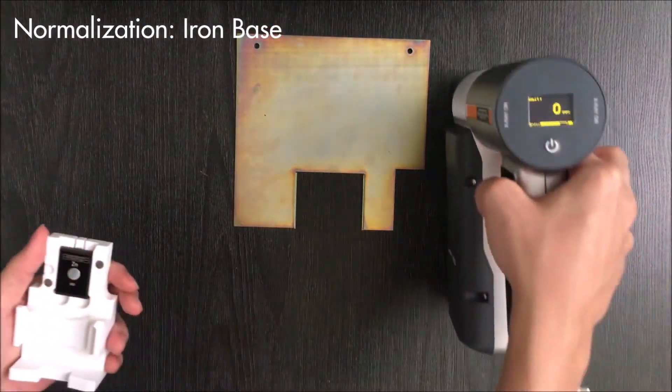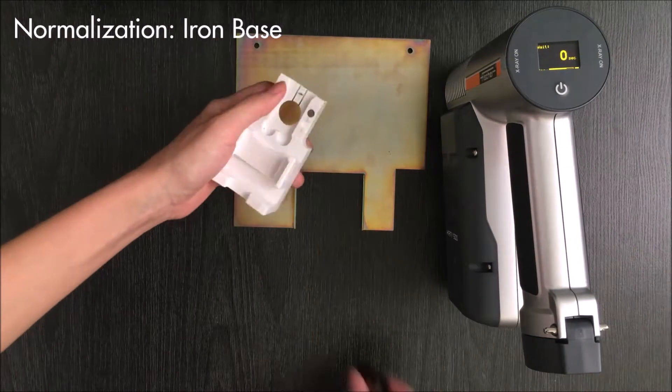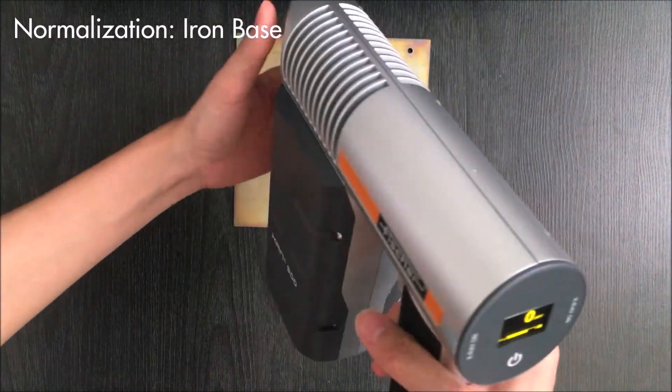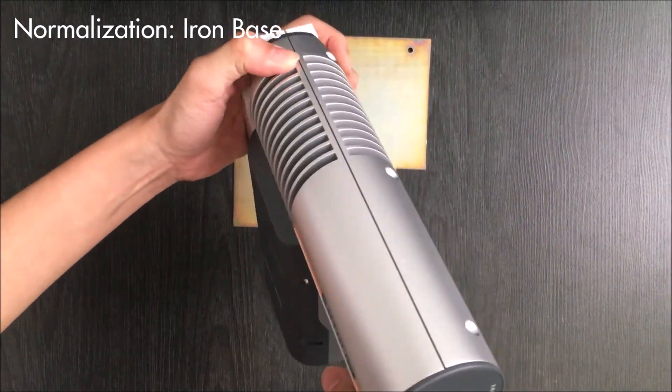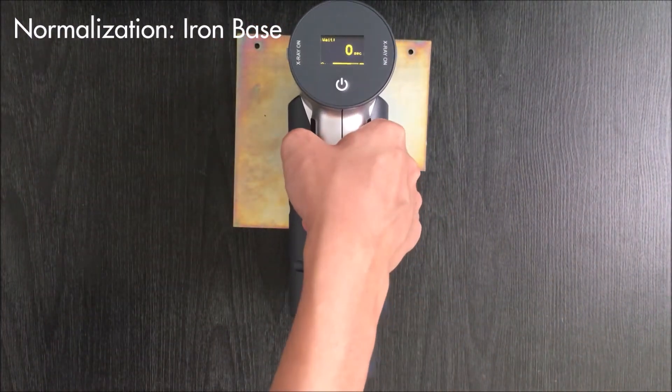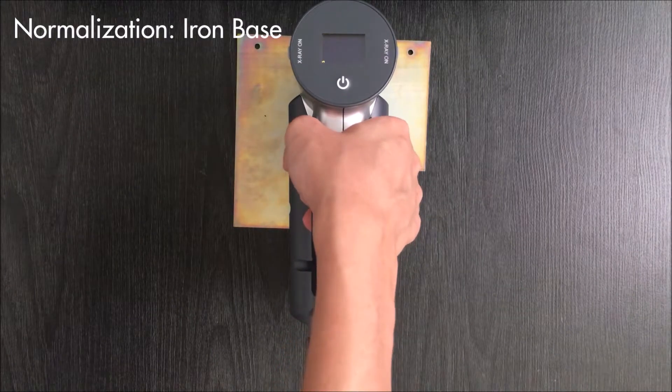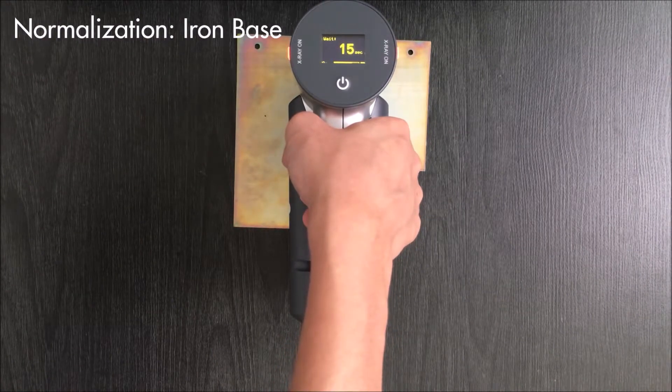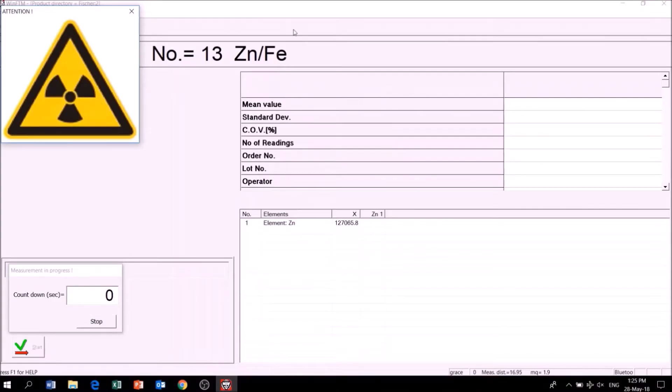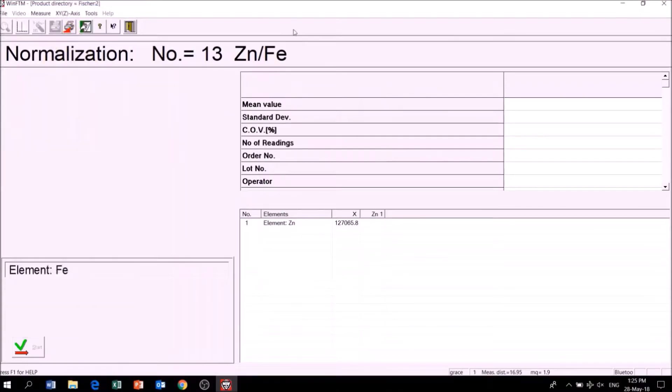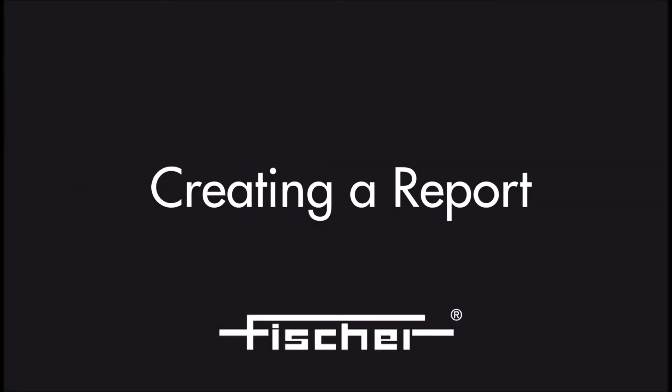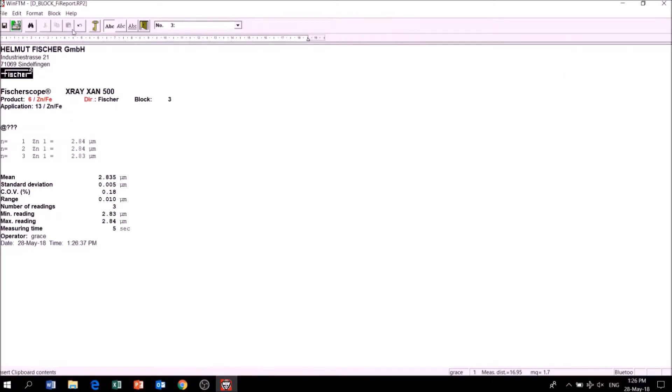Next, the normalization is complete. Finally, I will create a report with the results. The report features measurement values and statistical information. It can be edited and a template can be customized if required.